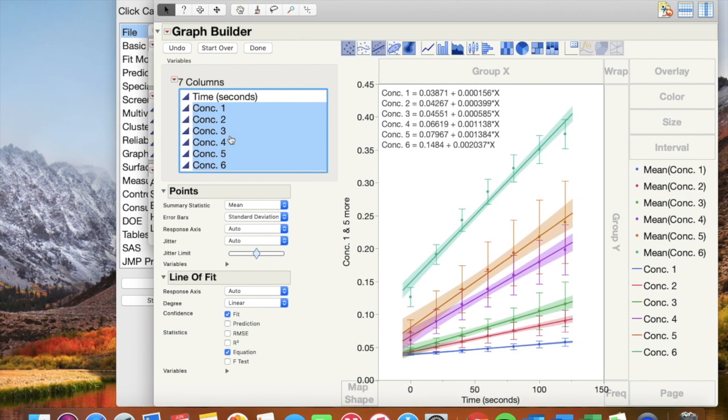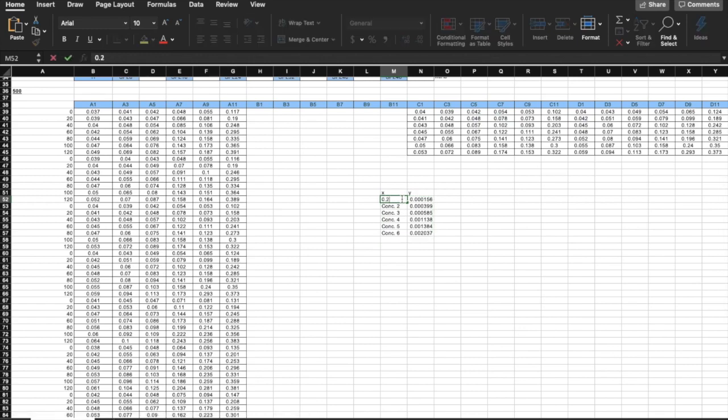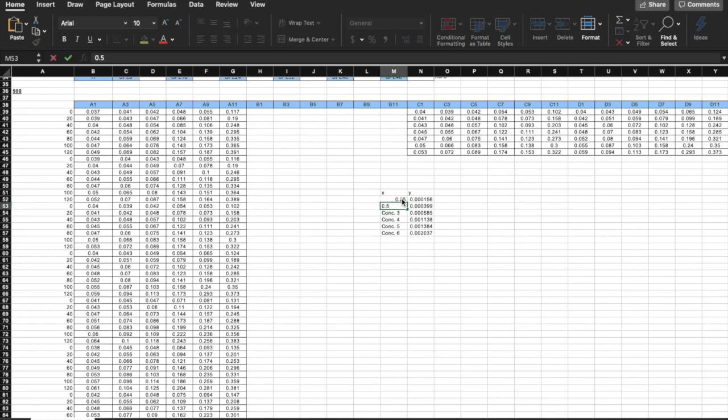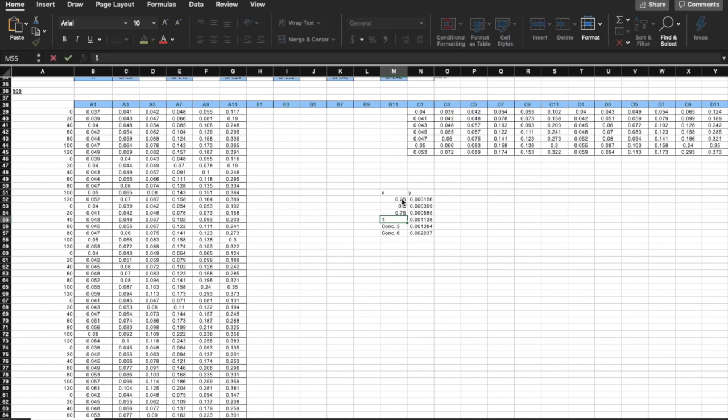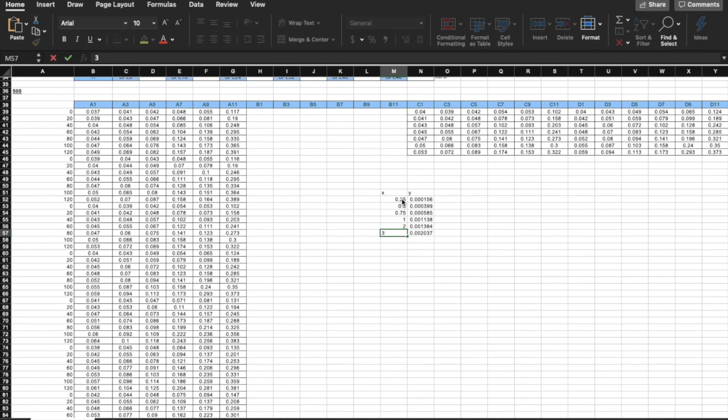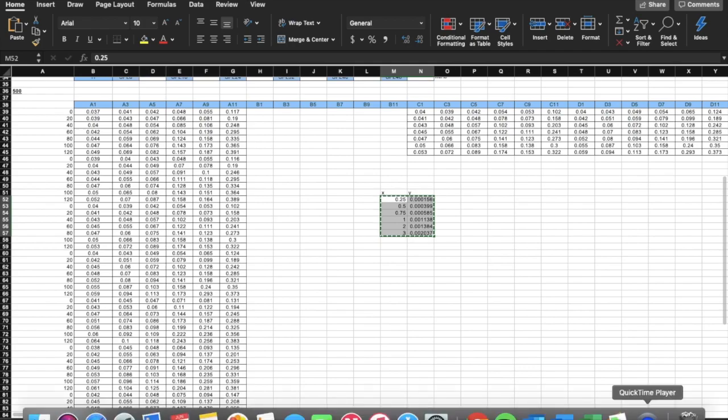Go back to Excel. Your x-axis is all the different concentrations of enzyme and your y-axis is all the corresponding slopes. Copy and paste with labels into JMP as shown.